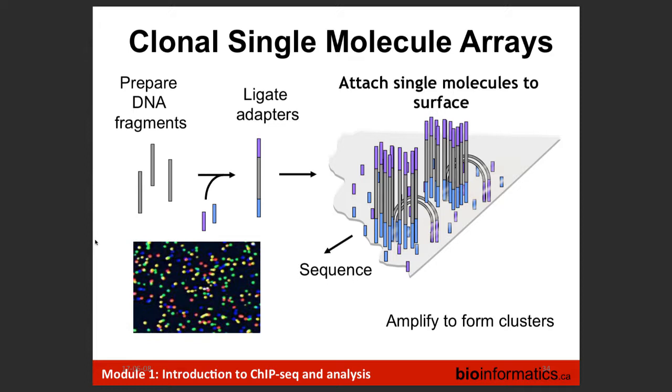And this has led to some problems bioinformatically where we're getting read through from adjacent clusters on the flow cell surface, something we call optical duplicates, and this you will see as one of the outputs of the QC of the run. If you've got a high number of optical duplicates, you've got a problem with your run, and I'll go through how that happens in just a minute.